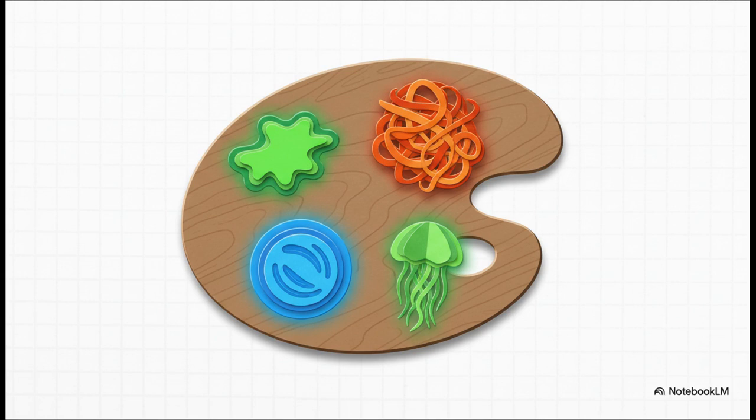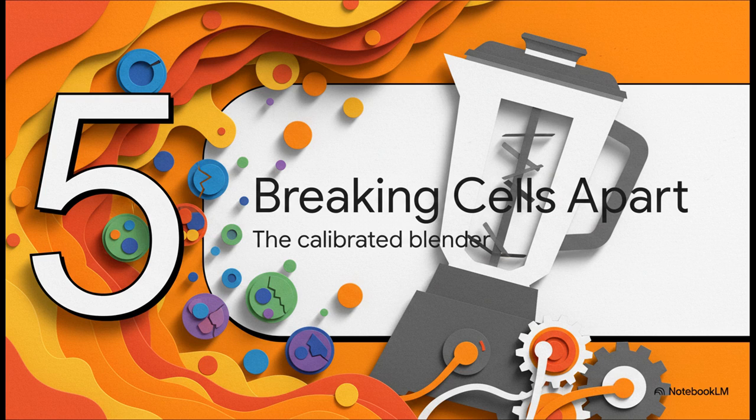It's the absolute go-to tool if a scientist needs to count how many cell nuclei are in a sample. And GFP? That is a total game changer. It's a naturally occurring green fluorescent protein originally found in jellyfish, and scientists can actually genetically program cells to produce it all by themselves.